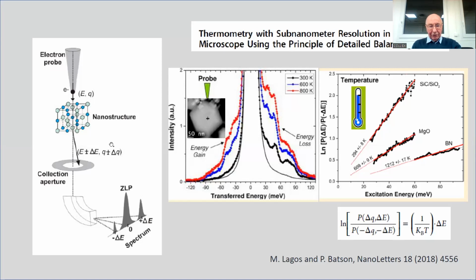Okay, this is what happens. So you measure in large angle there, you measure the energy gain. And this is the spectrum of there at different temperatures. So this is another way of measuring temperature, which has appeared recently in the literature.